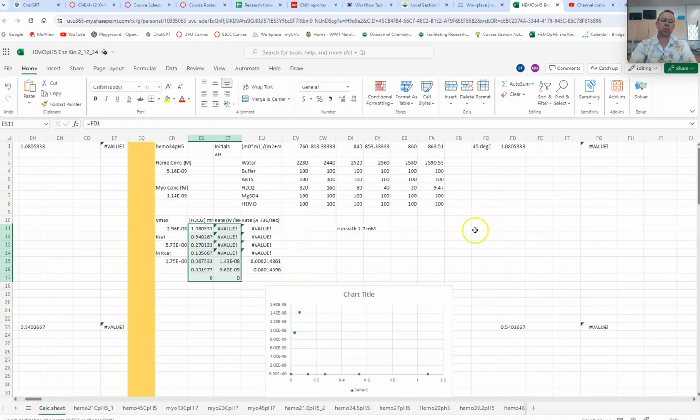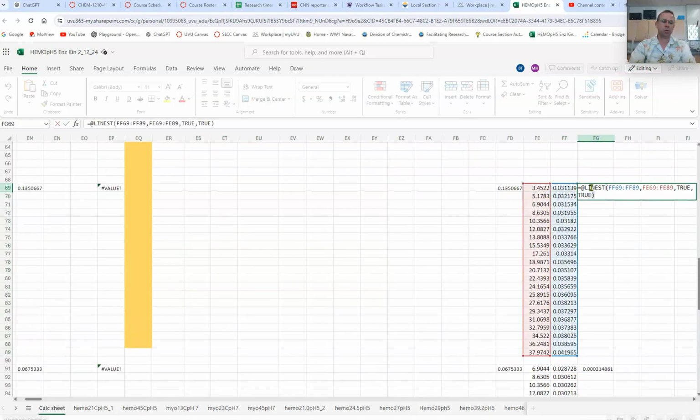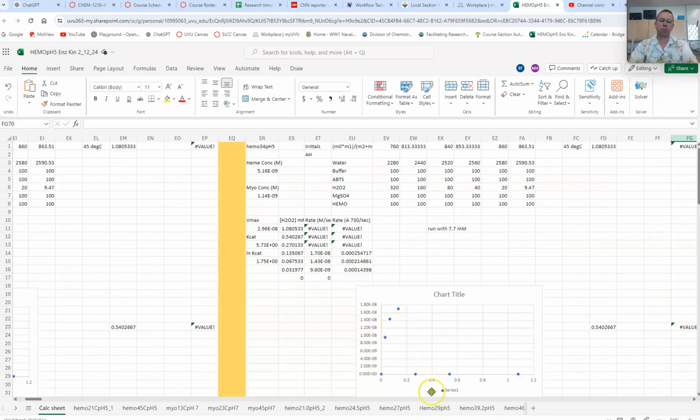This is my third set now. All right, my first and my second there. This one's going to go here. This value here is just perfect, so that's great. I got a new slope there, and there's my third point. Excellent. I'm going to go back again and get my fourth point.